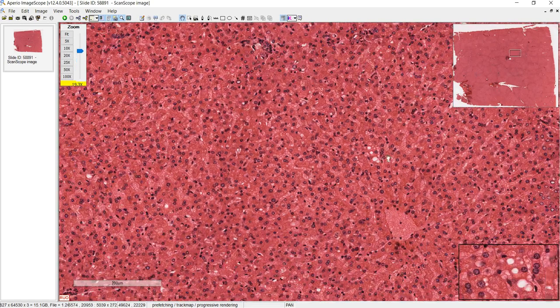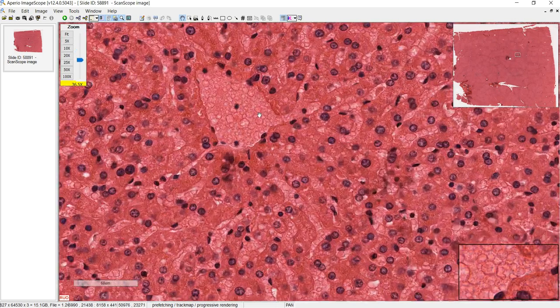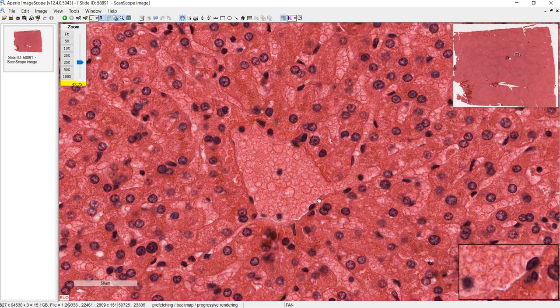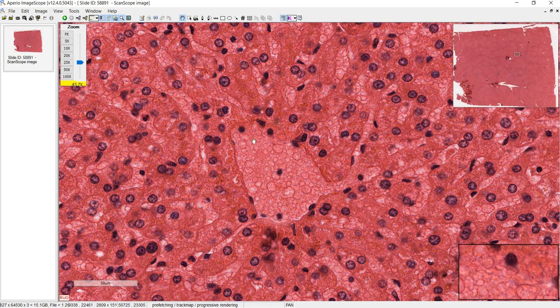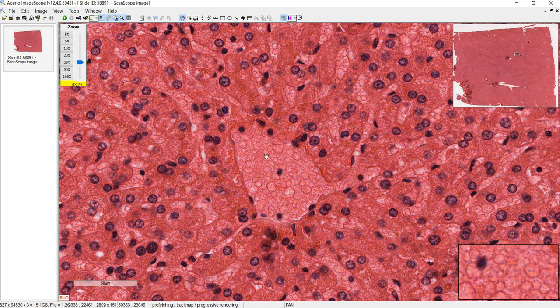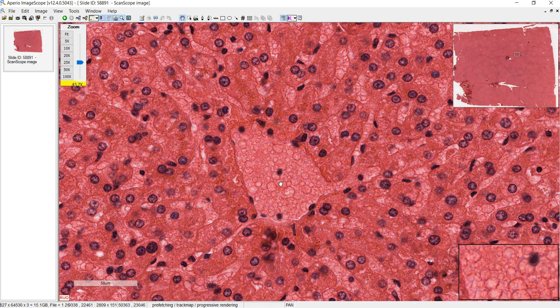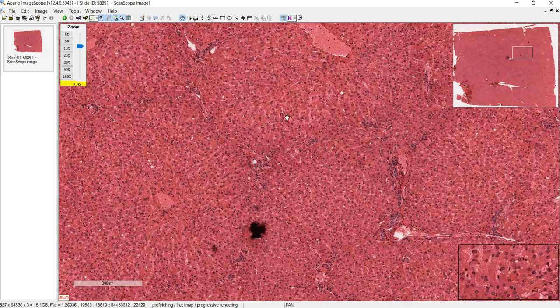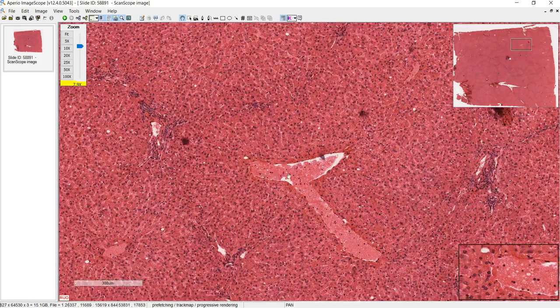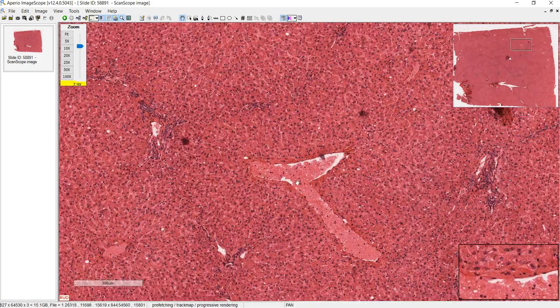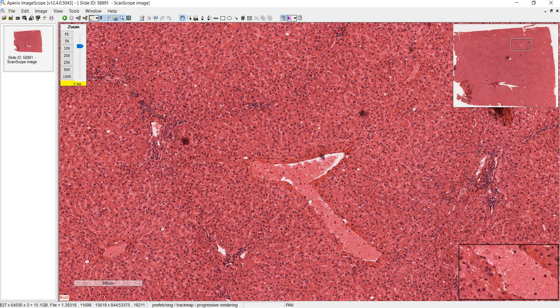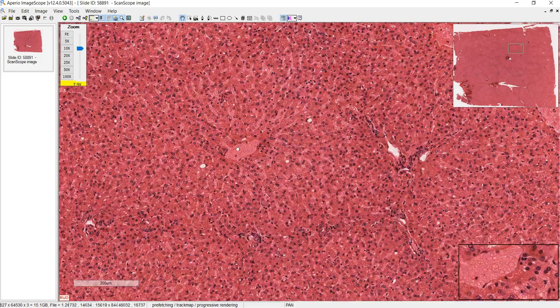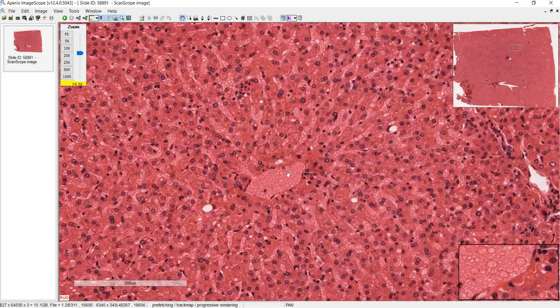Now let's look at the central vein. I always look for something that looks like basically a big hole filled with red blood cells — so this would be a central vein. This looks like maybe two central veins in a strange section, and here's another one over here.